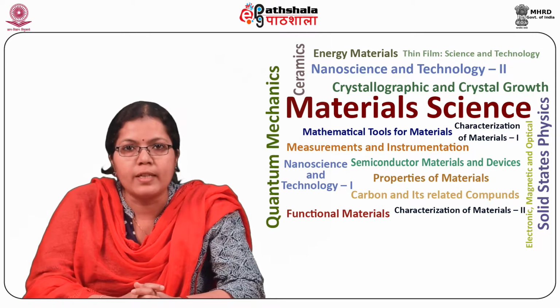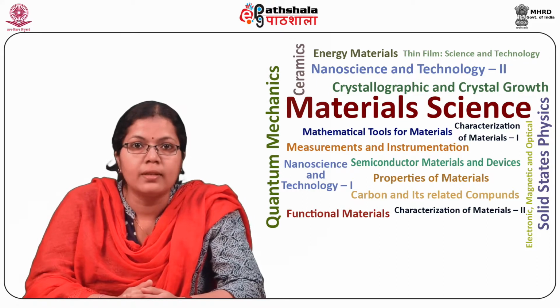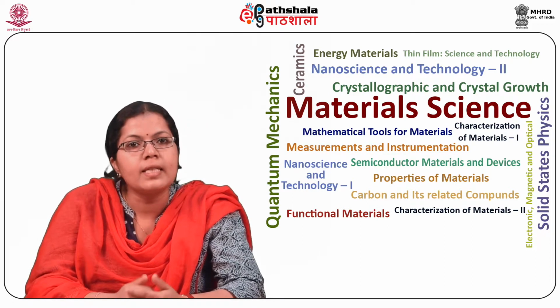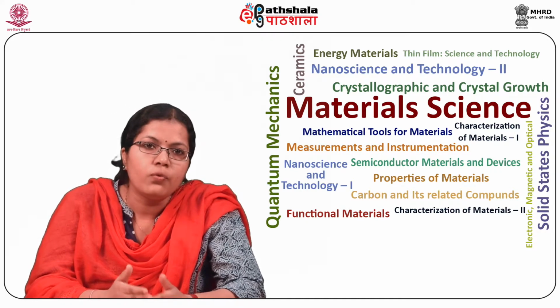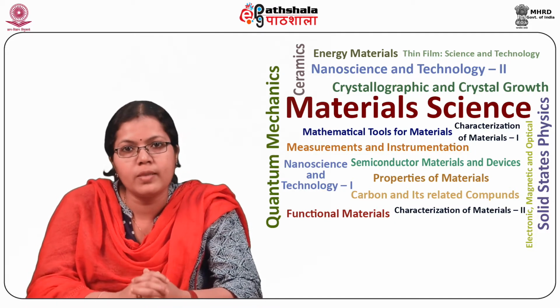The various components in the SEM can be summarized as follows. First, a source, that is the electron gun, produces the electron beam, which is accelerated down the column. Next is a series of lenses, that is the condenser and objective, which act to control the diameter of the beam as well as to focus the beam on the specimen.